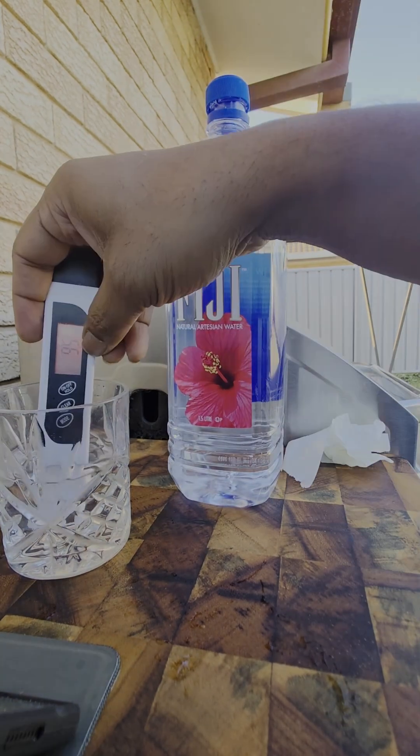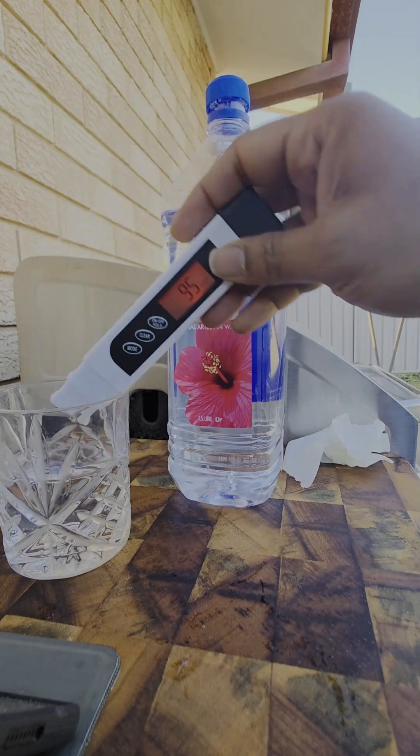Let's check with Fiji water. This has 95 ppm, well within the range.